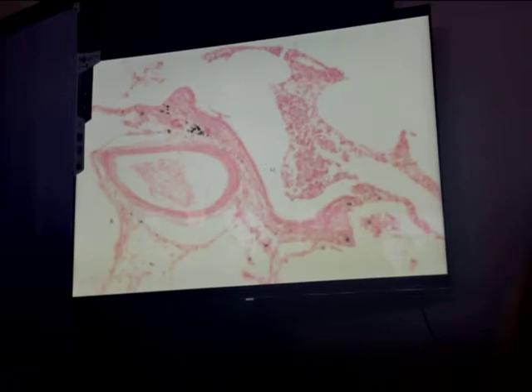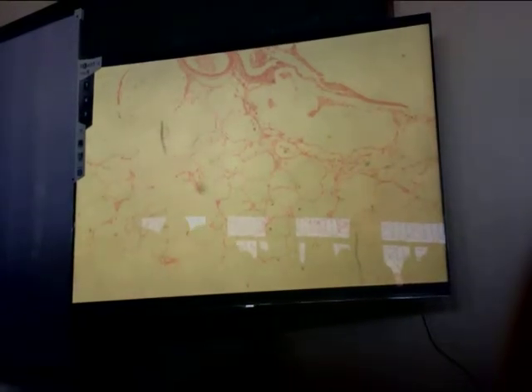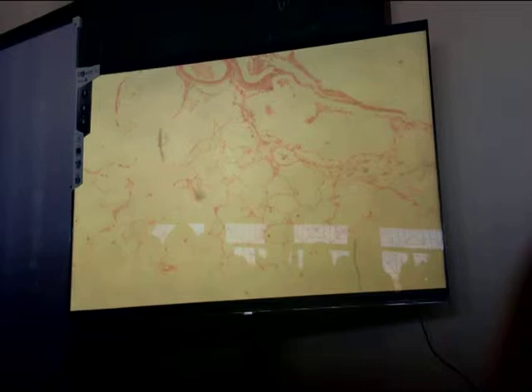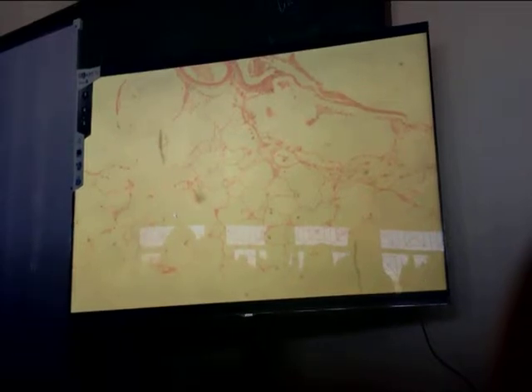What is your diagnosis of the pointed abnormality? Anthracosis. Okay. So another evidence of anthracosis. Now the problem with this lung is that there are regularly sized alveoli which are admixed with dilated alveoli.